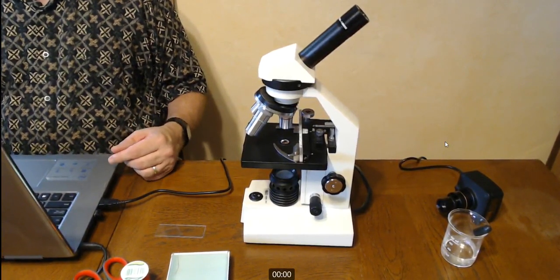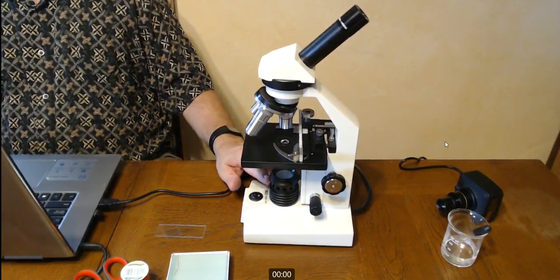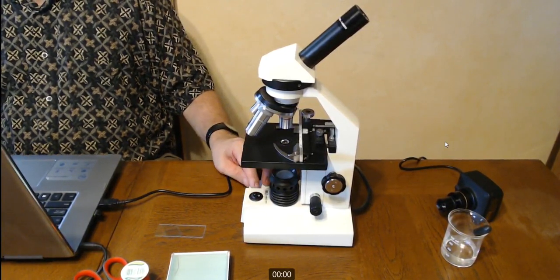Underneath is the light source. This light source has a big black metal piece around it, which is called the heat sink.